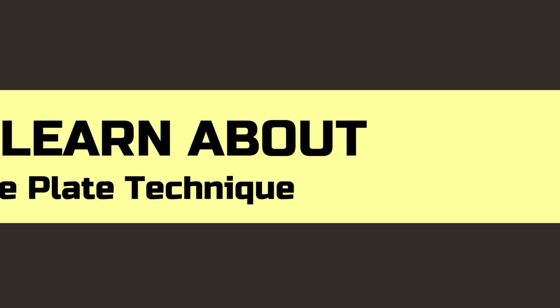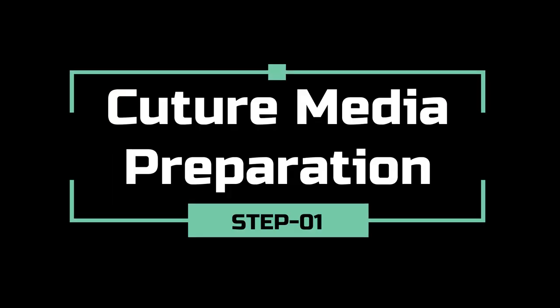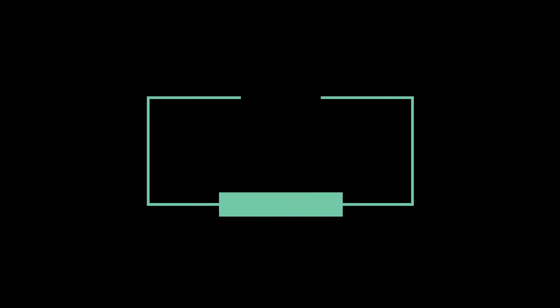Let's learn about the settle plate technique to check the microbiological condition of a laboratory room or area. Prepare the tryptone soya agar plate by following the manufacturer's instructions as shown in the display. Now we are going to the main test.